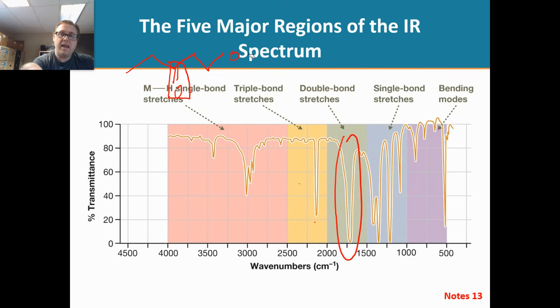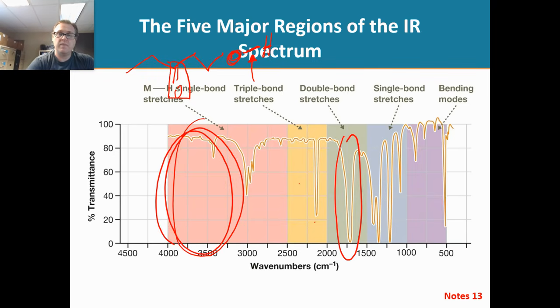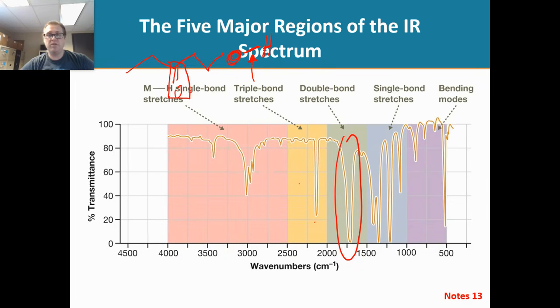I see an oxygen hydrogen bond, so I'm looking at that stretch right there between the oxygen and the hydrogen. Well, that would be found around this region or over here. And so this slide helps you to zone in at the area that you need to.